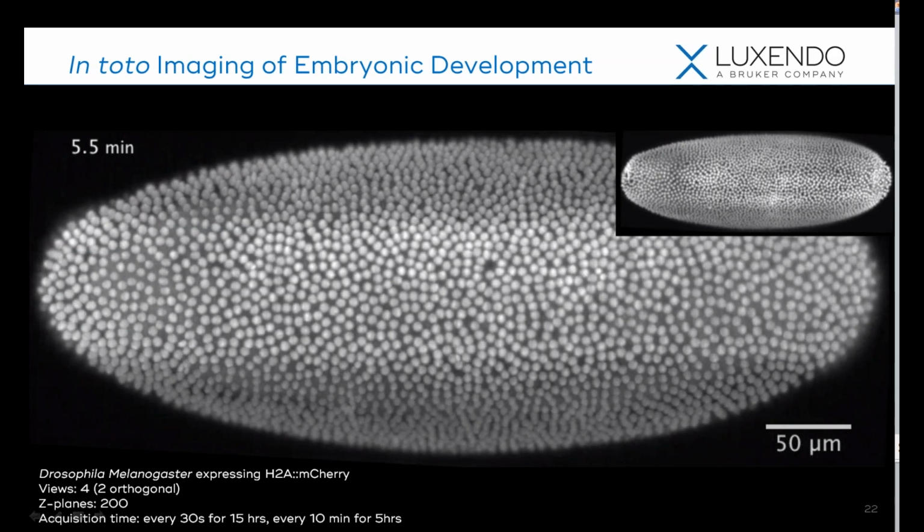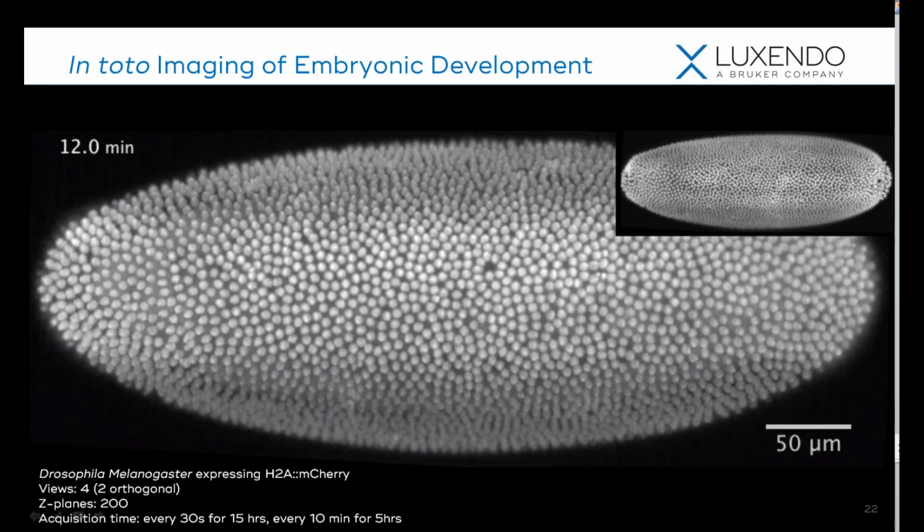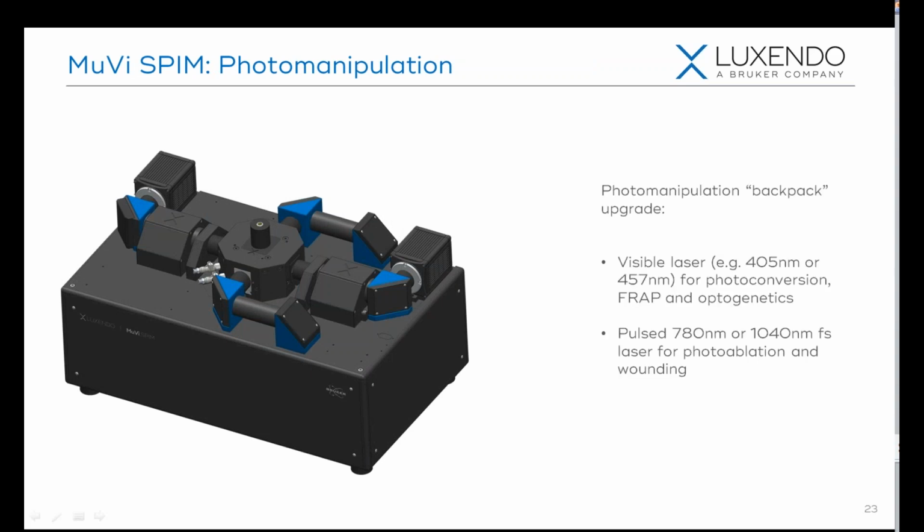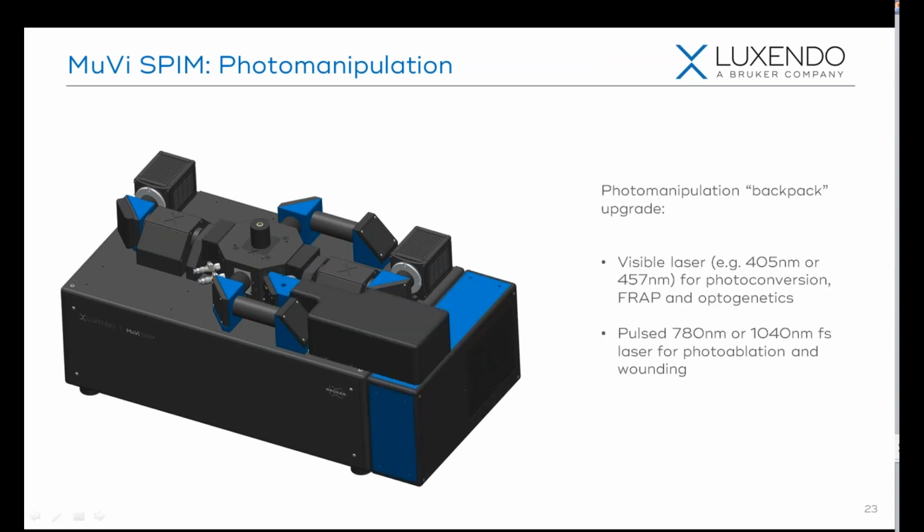And so, keeping this in mind, what Luxendo has developed is a photomanipulation add-on, allowing us to bounce in different lasers for different photomanipulation protocols.